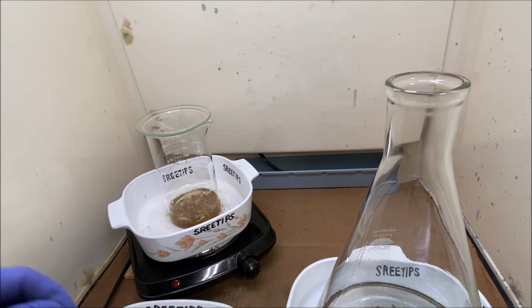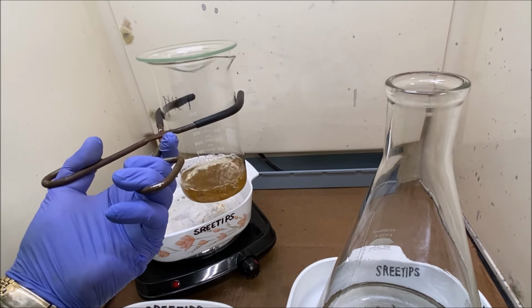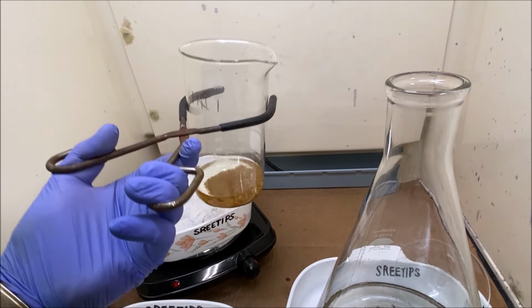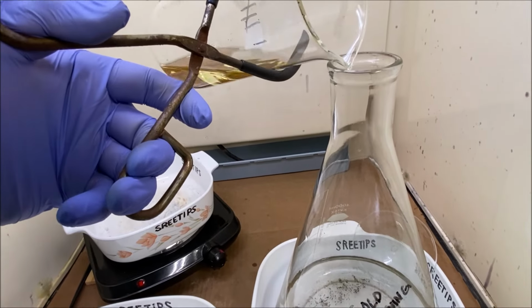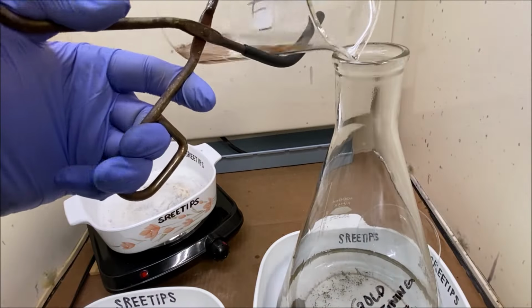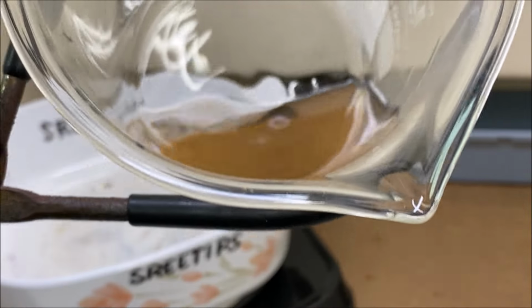What we'll do is go ahead and pull this off of here and dump off this waste solution. Look at that. Nice brown color. Put a little bit of gold in solution, looks like, from the yellow color. Stuff just really looks really, really good.